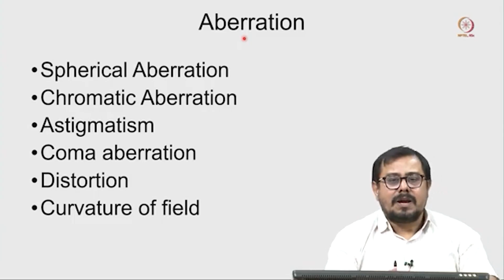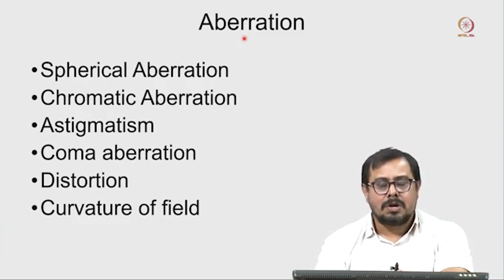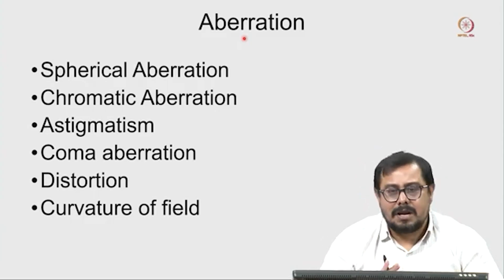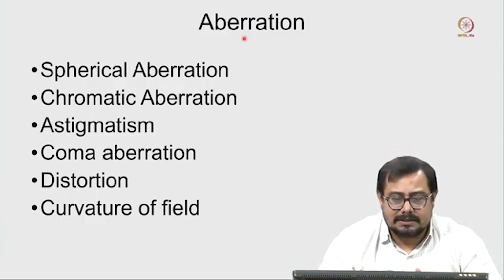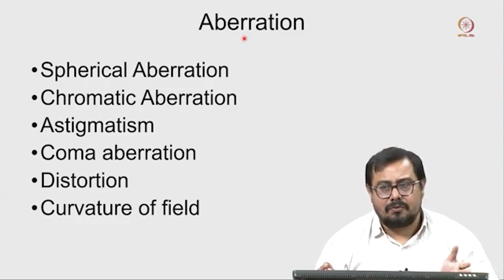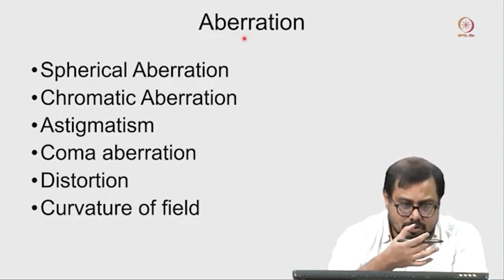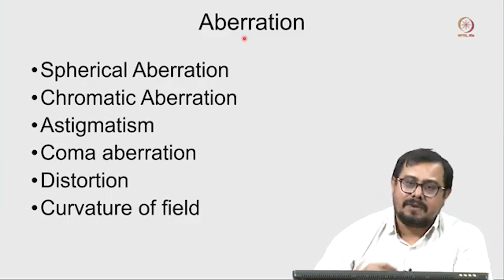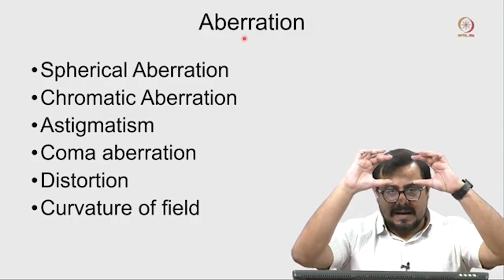They come together and give some kind of phase difference and give us an image. But in most cases our lenses are not in an ideal condition. So there will be some differences. Even glass lenses are not uniform, not symmetric. Same thing for the electron microscope also, and it is a very difficult task to put so many electromagnetic lenses together.